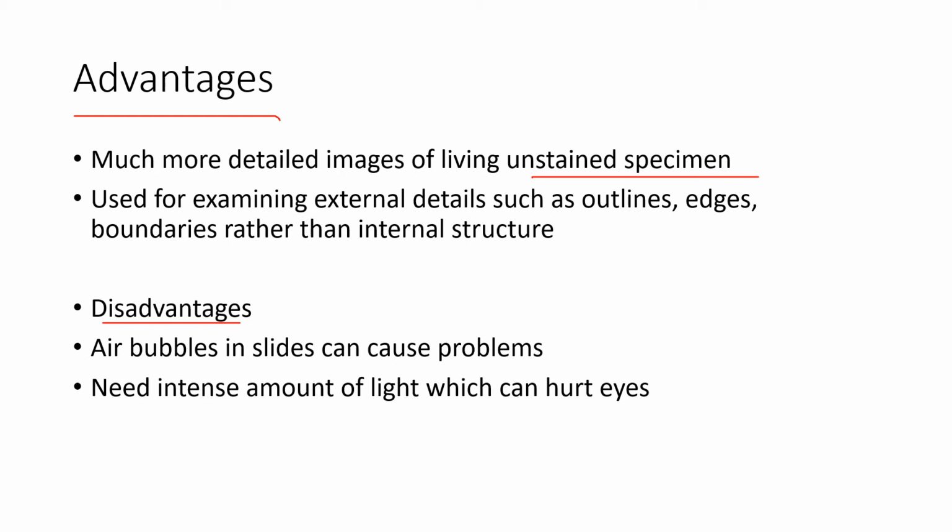And we use it for external structures like the outline, edges, and boundaries, rather than internal structures. Like you have seen in the previous images, the internal structure was not that clear. Of course it is not that clear because we are using the same wavelength of light, so resolution is not that much intensified. But the outline, the edges, and the boundaries are all getting magnified because the background remains dark. That is the main thing.